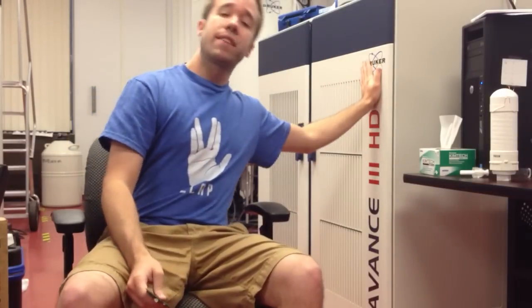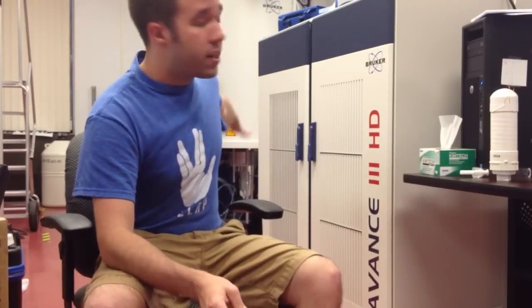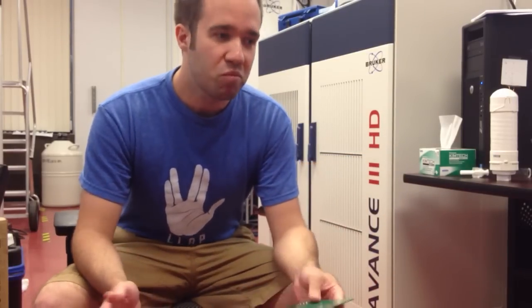Behind me is a high field NMR spectrometer. This runs at about 700 MHz and it uses a superconducting electromagnet to actually probe the chemical properties of a sample. Well, while that's great, NMR is a versatile technique, a few million dollars price tag makes it a little bit outside the reach of a hobbyist.